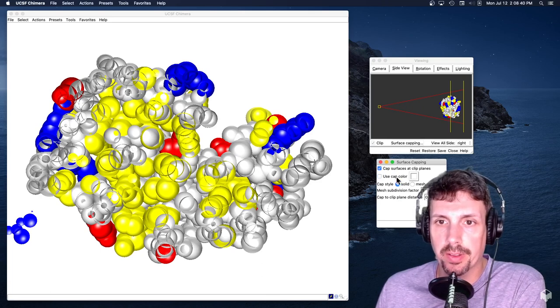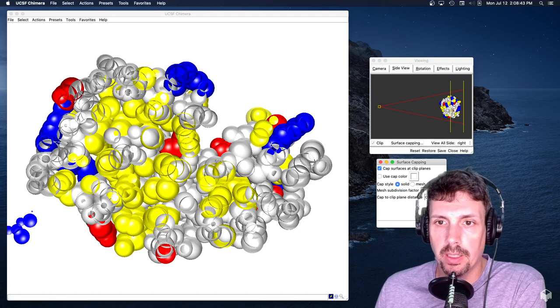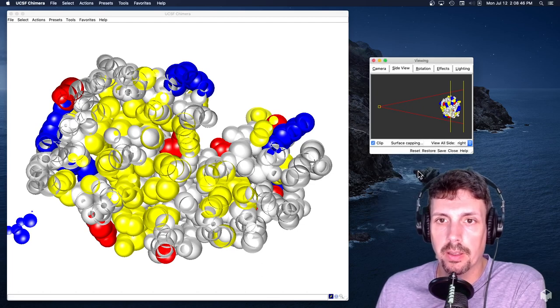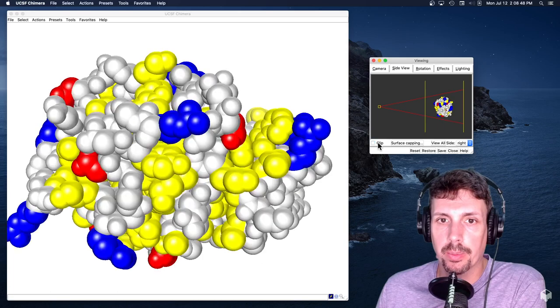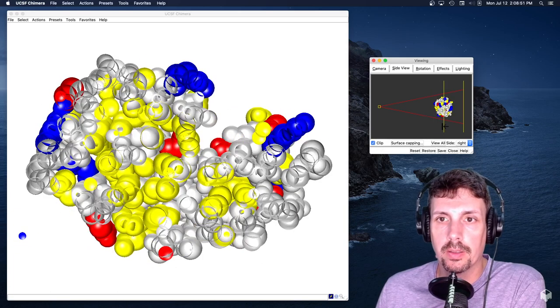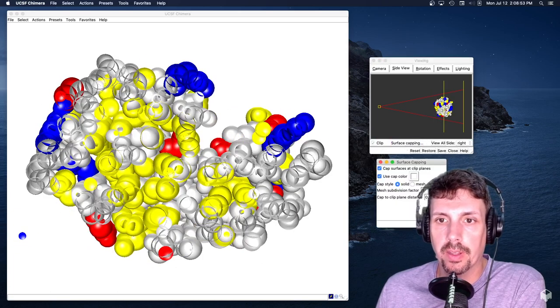Cap surfaces of clip planes, cap solid. Why can't, why doesn't it apply? Clip. So to go back to cut it in half, surface capping.